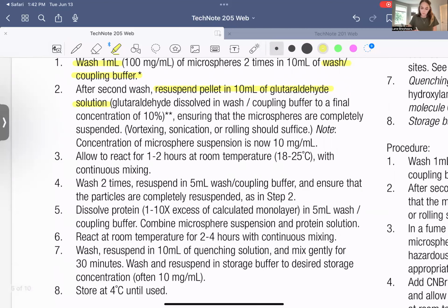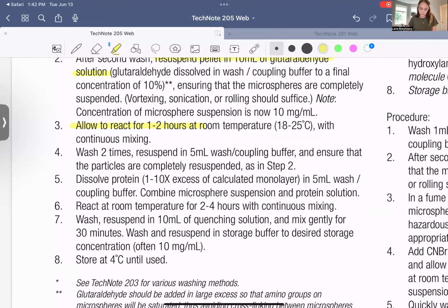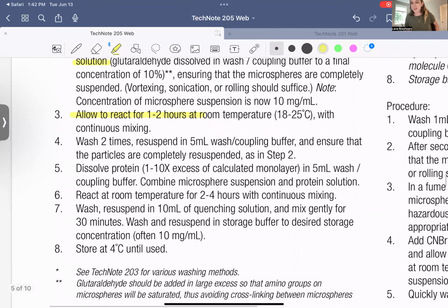Incubation period. A longer incubation period, which is cool. If you get into the dynamics of that reaction, it just needs a little bit longer. Always fun to learn about that. Okay, and then we start over.